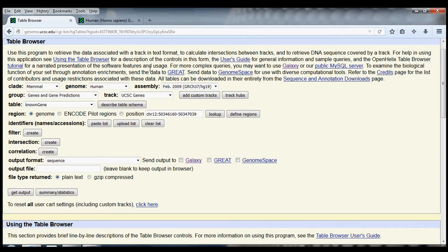For example, let's suppose that we wanted to know the sequence of a gene — let's say the gene aquaporin-2, which is a membrane protein that allows water to pass into the cell. If I wanted to know the sequence of aquaporin-2, I would start off by selecting the group, genes and gene predictions, the track UCSC genes, the table of known genes, and then I'll put in the identifier of the gene of interest.